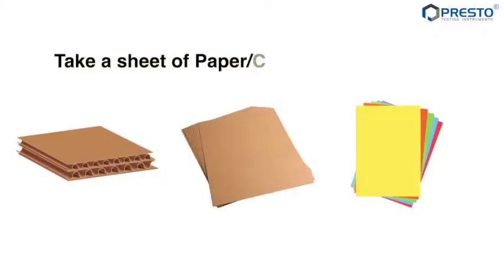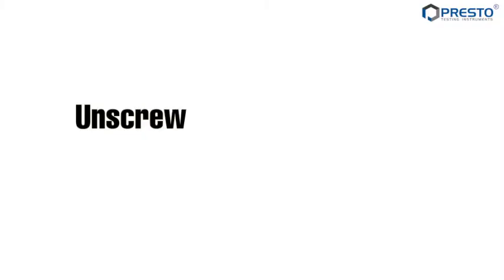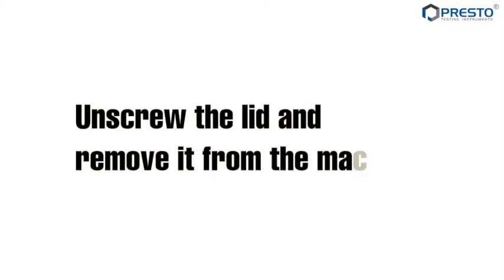Take a sheet of paper, cardboard, or fiber board. Unscrew the lid and remove it from the machine.